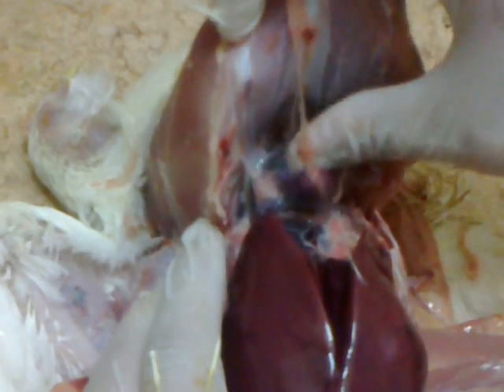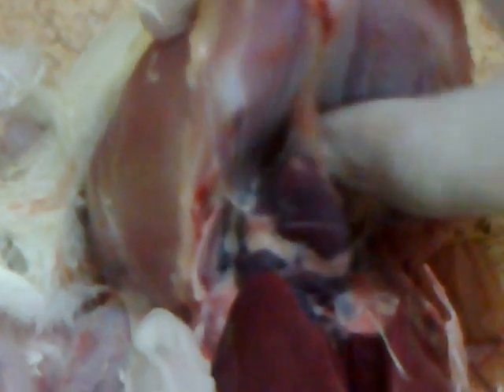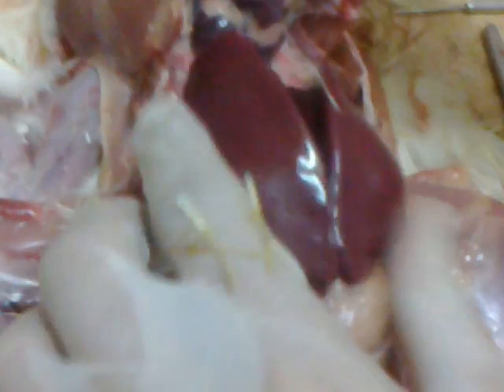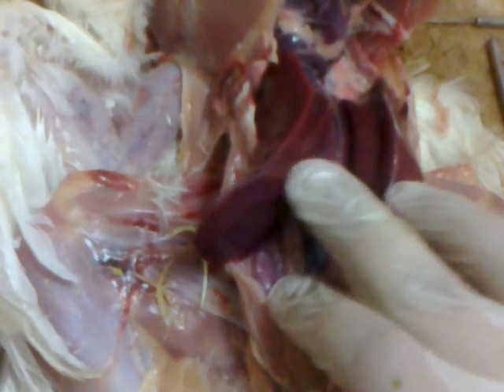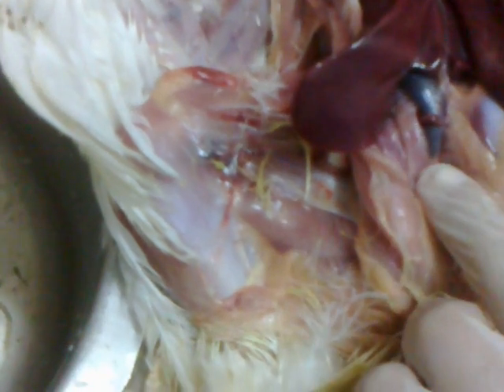As you see here, the first thing that you will see is the heart. Of course, congestion is all over because the bird was killed by the stunning method or head twisting. This is a very clear liver with no lesions. Left lobe, right lobe — the left lobe is fissured. The right lobe contains beneath it the gallbladder; the left lobe contains beneath it the spleen. The spleen is under the left lobe.